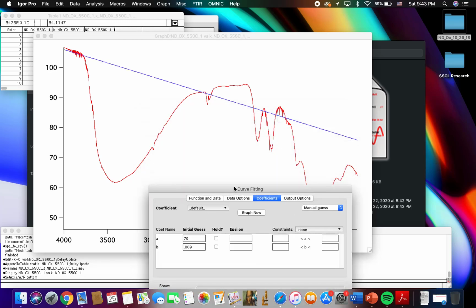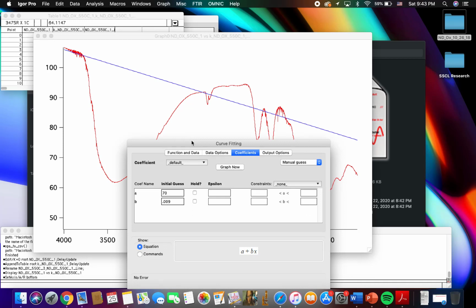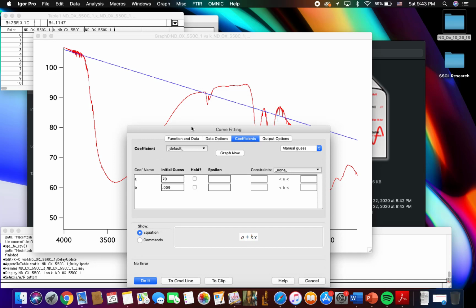Okay, so you can see we're pretty close. We just need this to kind of come on top. We want the line to float on top of our scans, not cut through it. So as you see here, it cuts through it. We don't want that. If you have stuff that starts cutting through, your analysis point starts becoming negative, and you know your lines and graphs after you do the KM transforms can subtract more than usual, and you don't get a very efficient graph. So we don't want that to be the case.